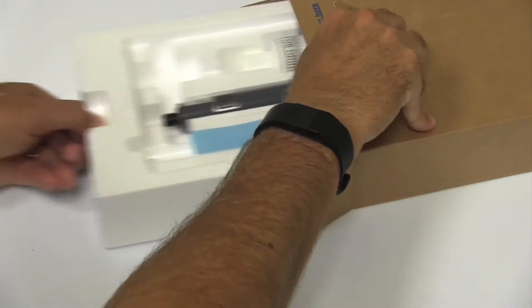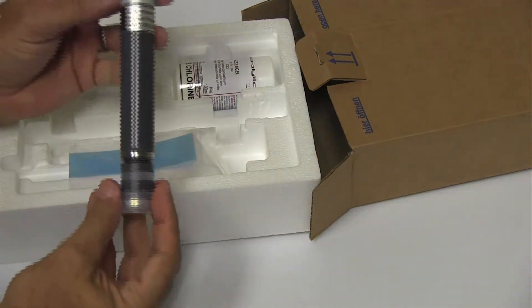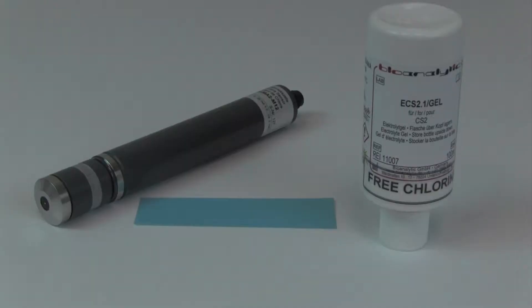It only takes a few minutes to assemble the sensor or to perform any routine maintenance. The sensor kit includes a probe with a membrane cap, a one-year supply of electrolyte, and a single piece of blue abrasive paper.